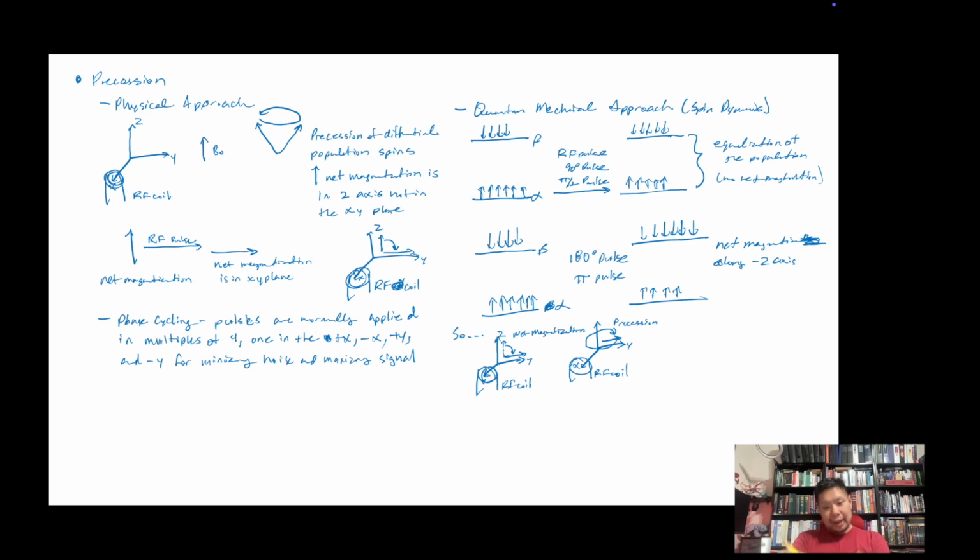In strong again, right? And so every single time the proton precesses and crosses my path, like my face right here, I detect a current, or it induces a current inside me, and I can detect it. And so what that means is that I, as the RF coil, detect a current, and that current is in the form of a cosine wave, right?